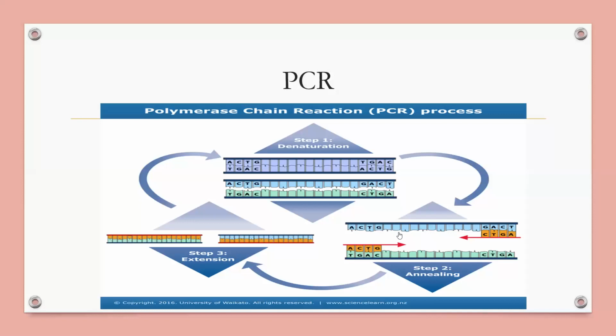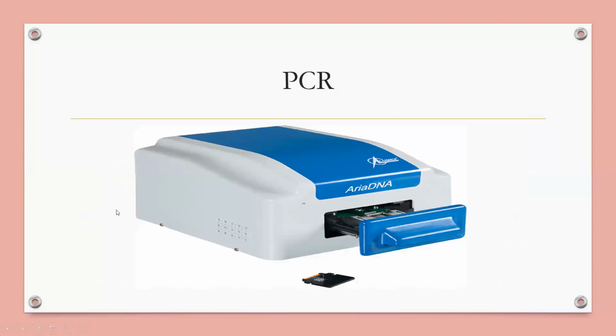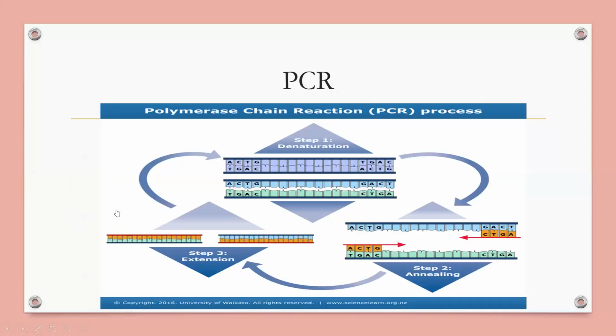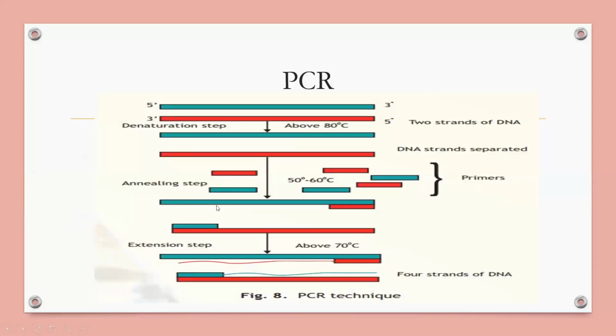Next, look at here. How do you understand? Primers bind to each strand. Next step, extension. How do you understand? This is annealing step. Next, extension step.